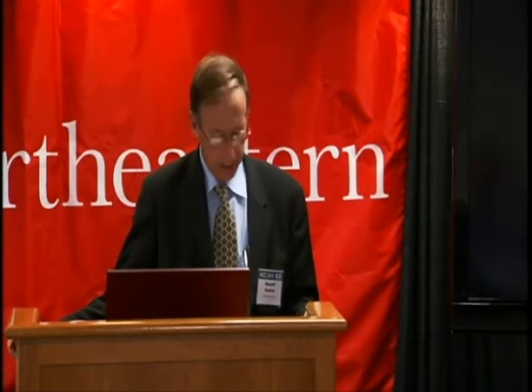I am a big fan of multiplexing. I think it's going to be the wave of the future. We'll stick to my favorite here, PSA. Right now, PSA is the test. 5 years from now, there's going to be a panel of assays. But then you think about the regulatory hurdles to get those panels of assays accepted. It's very, very difficult, and you're just going to dial that into your planning.